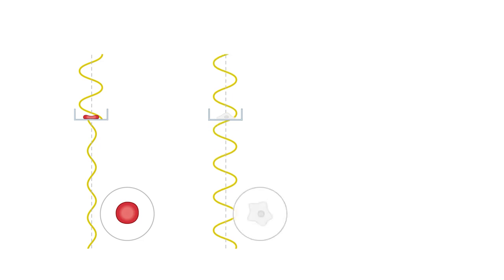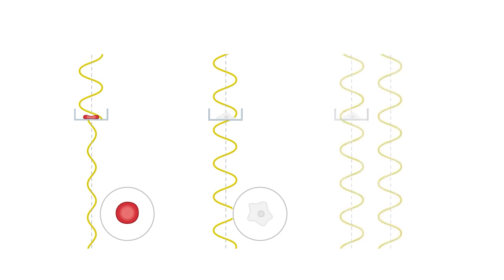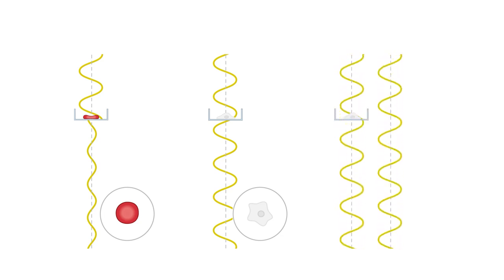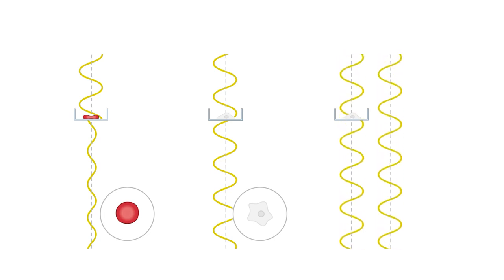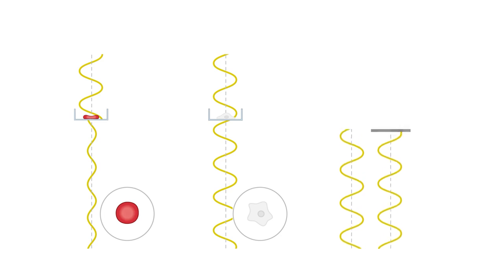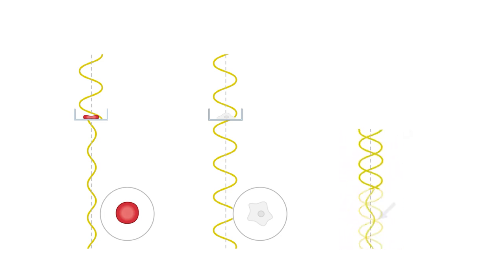When light passes through these cells, there is only a slight phase shift that is almost invisible. In phase contrast microscopy, this slight phase shift is used to increase contrast by passing the non-diffracted light through the phase plate. The phase of the non-diffracted light is shifted so that an interference pattern is clearly visible. The non-pigmented cells are now visible with good contrast.